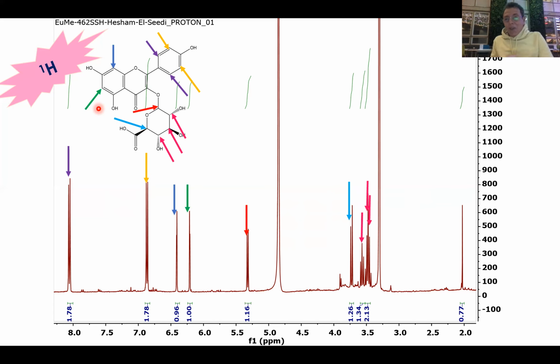I think you all agree that we love proton NMR since it is really consistent with physical organic chemistry, that the hydroxy group is an electron donating group. That's why you see this at the lower delta value, which is shielded, while this is in meta position, which is much more de-shielded, right?